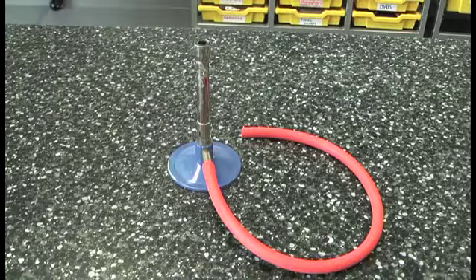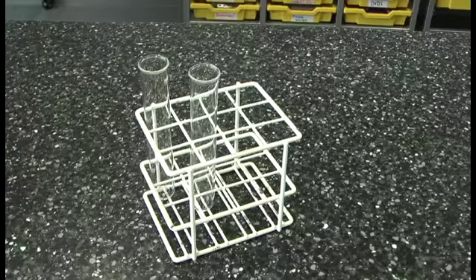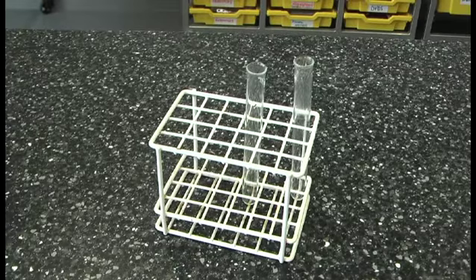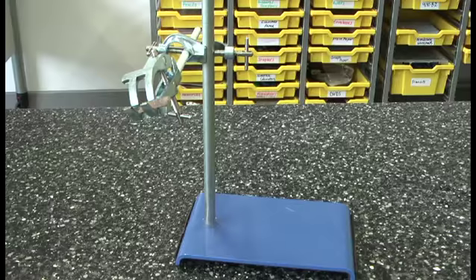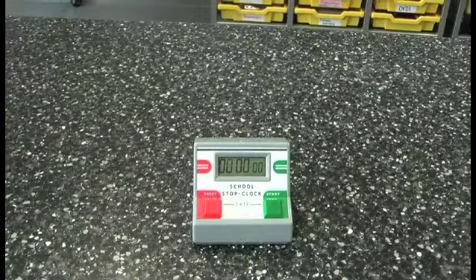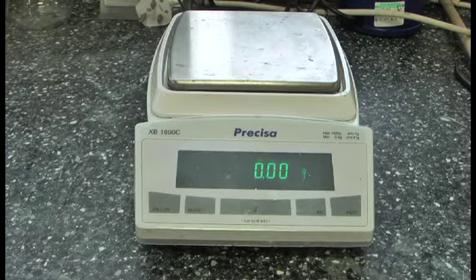A delivery tube, a Bunsen burner, boiling tubes and a boiling tube holder, some test tubes in a test tube holder, a torch stand, boss and clamp, a spatula, a stopwatch and finally a mass balance.